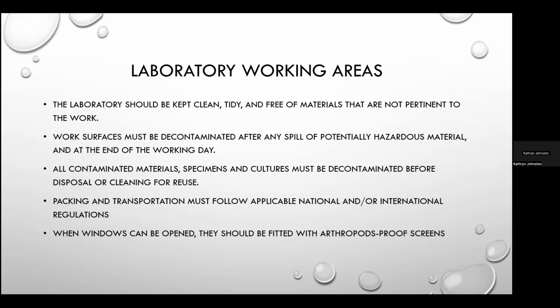Laboratory working areas: the importance of cleaning the work area when handling potentially infectious material, I can't stress it enough. Because the ease with which we can inadvertently transfer those microbes from our work environment to our mucous membranes with our hands is high. It's important to also prevent infestation with mosquitoes, flies, and other arthropods.